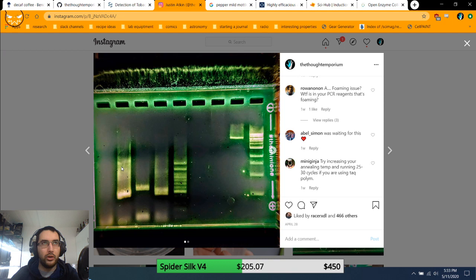And what's nice about this is not only are these lanes positive, you've got a band here that's a very specific size. So this is an agarose gel. Basically what you do is you put your sample in the little hole at the top, and this is all in a tank of liquid, and you put a voltage across this gel. The smaller the piece of DNA is, the faster it moves through the gel, so it'll end up lower down on the gel once you've let it run. These bits at the bottom are the primers. These are the bits that let you target the specific pieces of DNA. They're tiny, so of course they're right at the bottom of the gel, whereas the product, the thing that we're actually looking for, is much higher up because it's bigger. It has a harder time moving through the gel. Whereas something like this, which is massive, has barely moved through the gel because it's so large.